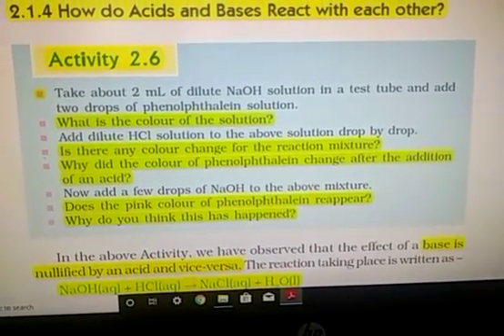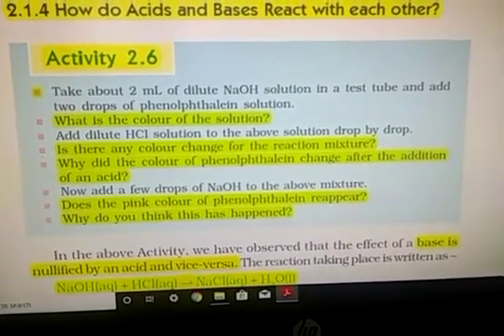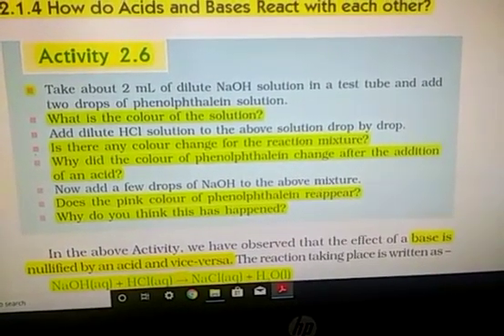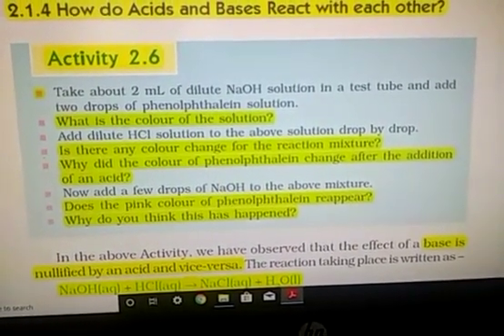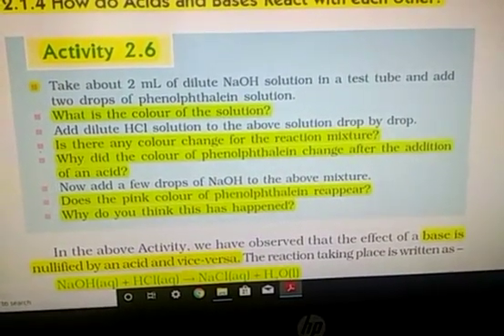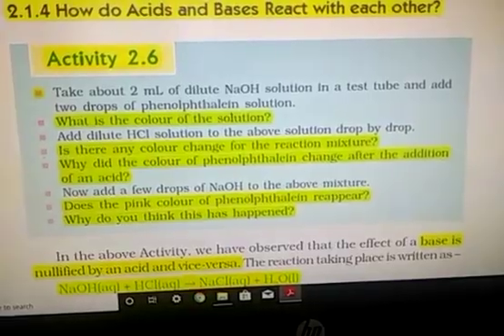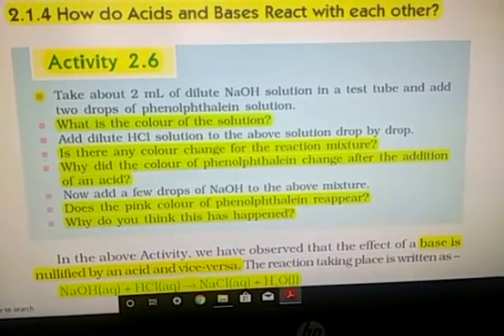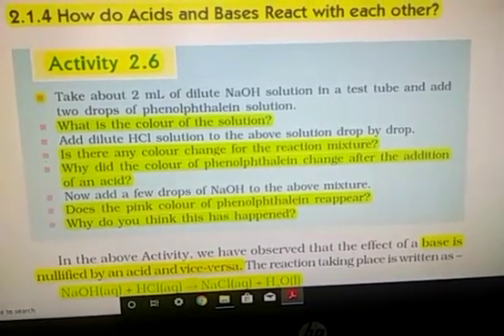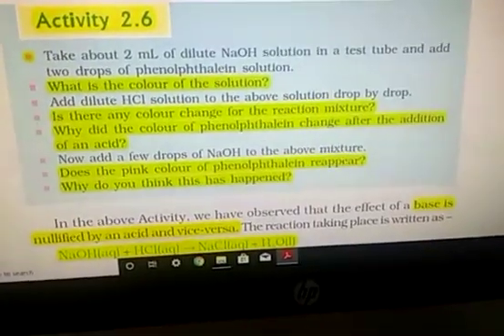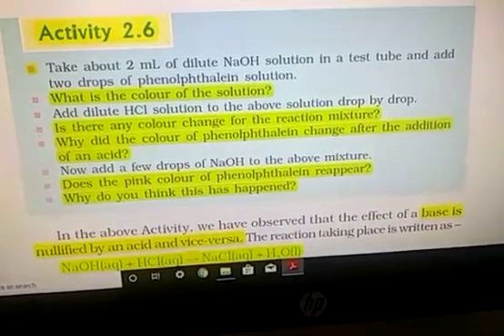Add few drops of HCl drop by drop, so slowly color disappear. Is there any color change? Yes, color change and color start to disappear and after sometimes totally disappear. Why did the color of phenolphthalein change after the addition of an acid? Acid react with base and neutralize it and form salt and water, sodium chloride and water. This is the reason color disappear because phenolphthalein gives no color in neutral solution or in acidic solution.